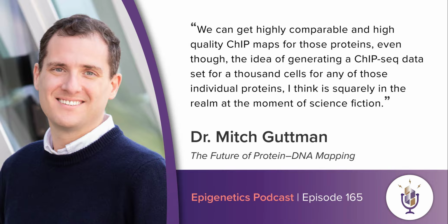So let's start with cell numbers. Obviously, cell numbers are an important consideration and frankly, an important limitation in methods like ChIP. In fact, I think probably the number one critique of methods like ChIP versus CUT&Tag and CUT&RUN are the relatively high numbers of cells that you generally and historically need to do a ChIP experiment. And this was something that we too were very sensitive about when we were thinking about and developing ChIP-dip. But there were a couple of things that we considered here.